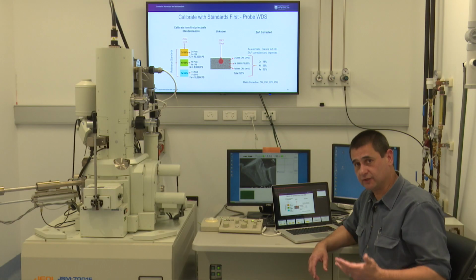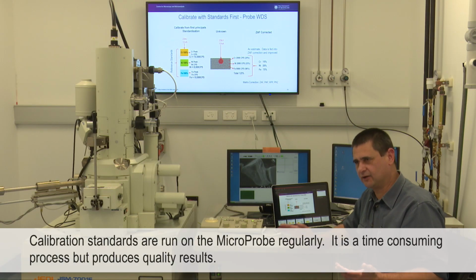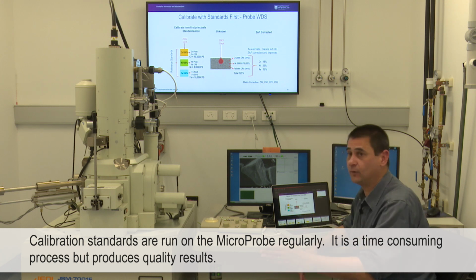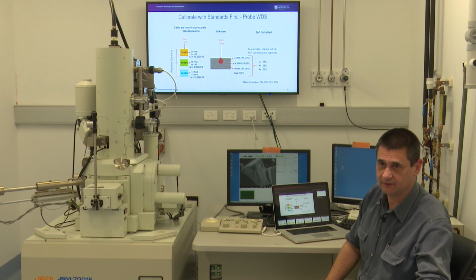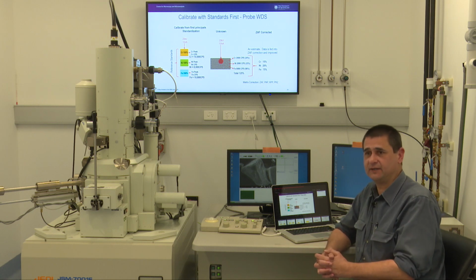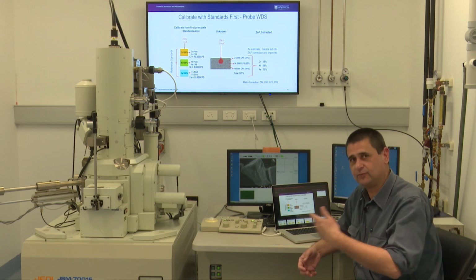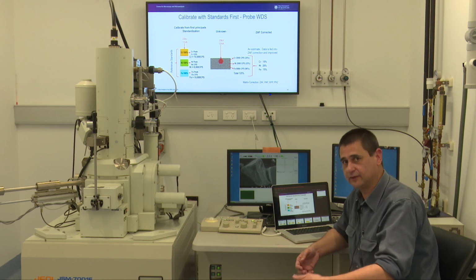Some of you will be joining me on the microprobe, and my colleague Ying Yu. We will be running calibration standards for your materials. It will be very time consuming, of the order of about a half hour per element on standards before we even look at your specimen. And a standard geological run might be 12 elements. That's 6 hours of calibration before I look at your geological specimen. But that's what you have to do to get good quality results.